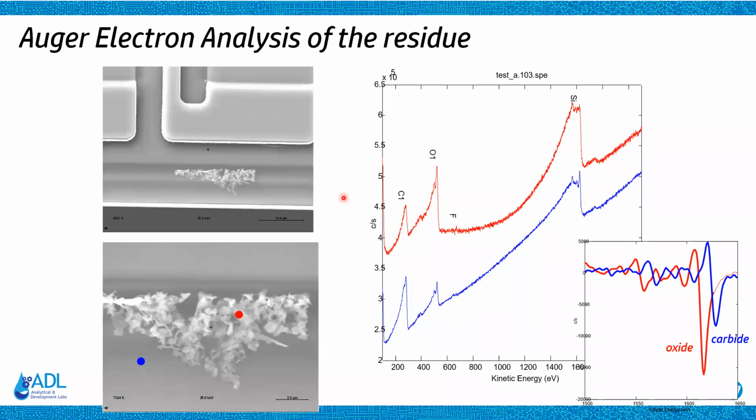You're looking at something different than what we were looking at with the EDS. And in this case, what you find is, if you look at this collection of particles that ends up on the edge of this die, you drop the beam on the particle, you drop the beam also on the substrate area here, and you find that in fact they are quite different.